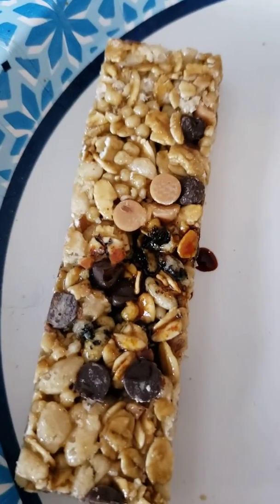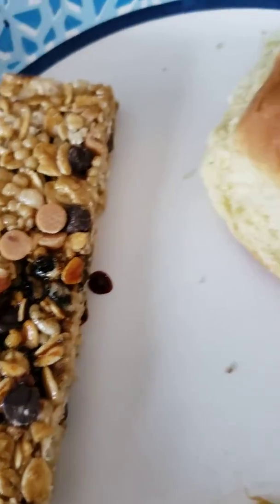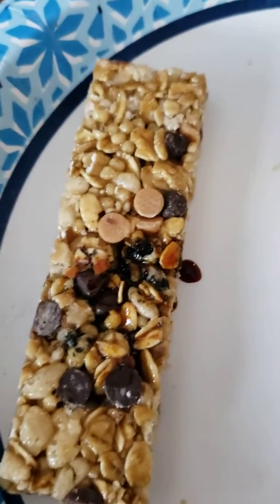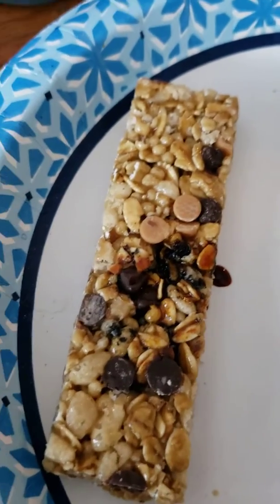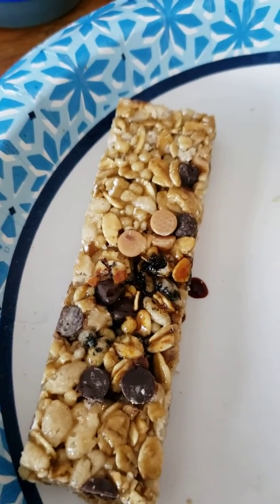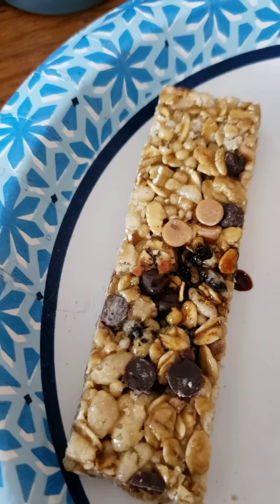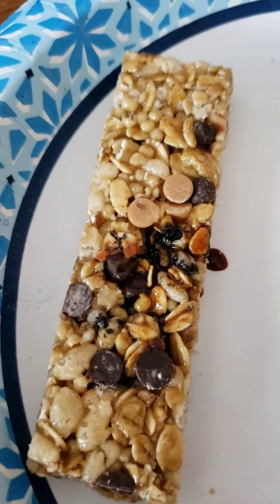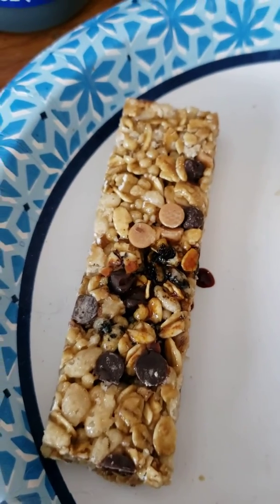And then the granola bar, I guess you could say it's a reddish brown color. So that means that it reacted with amylopectin, and it has a certain type of starch content, which is composed of glucose units.